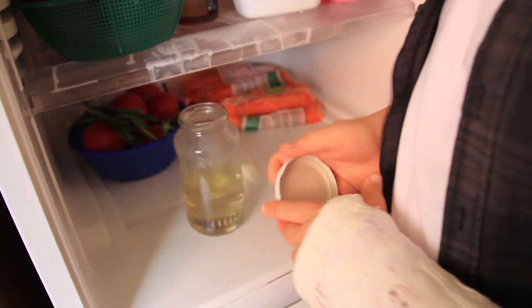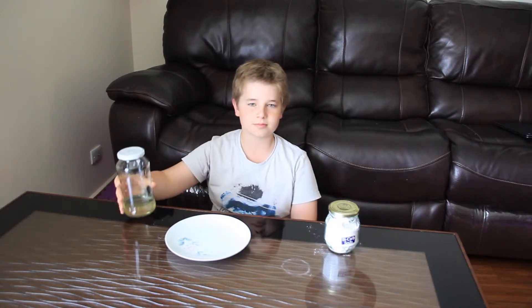Cover the solution and put it in the fridge. Now that your crystals have cooled they should look like this. It is time for the funnest part of this experiment — the making of the crystal sculpture.